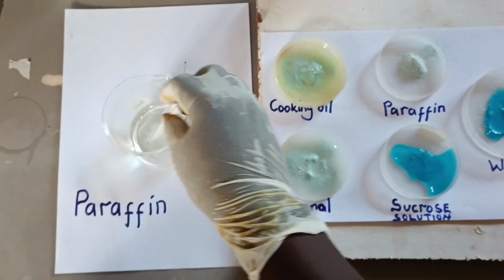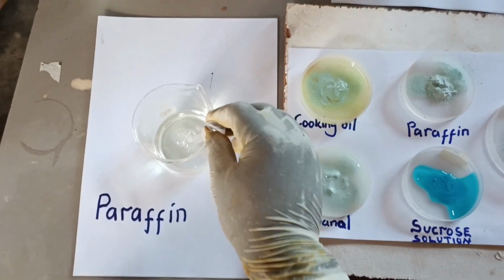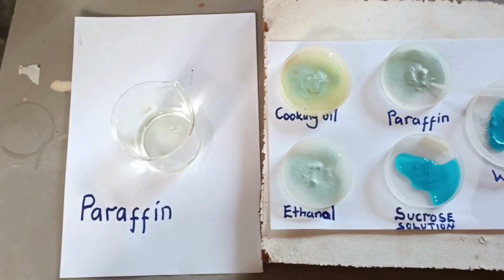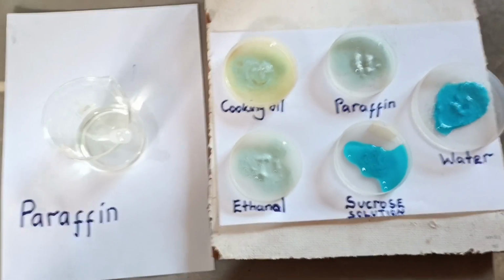We go. Next on agenda is paraffin. When paraffin is added on anhydrous copper 2 sulfate, the color of anhydrous copper 2 sulfate remains. This implies that in paraffin there is no trace of water in it.